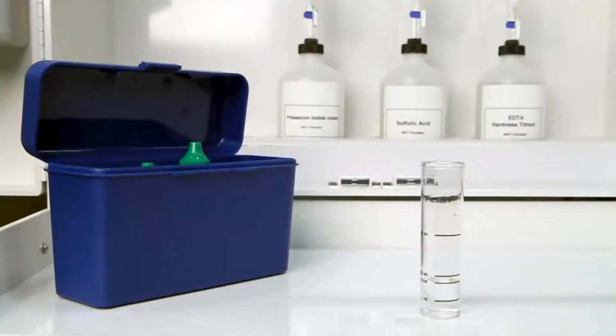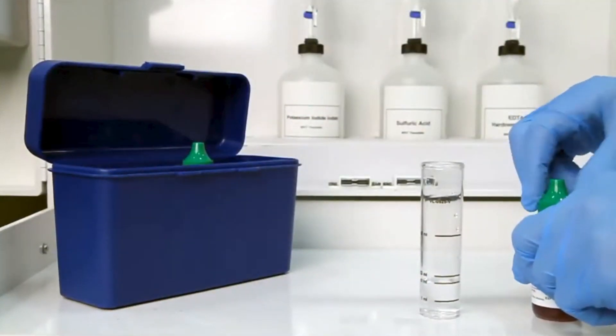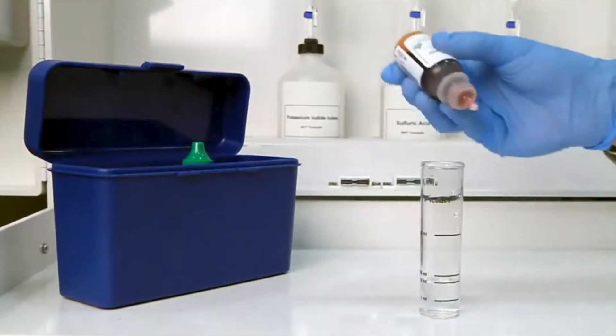The next step according to the EndpointID procedure is to add eight drops of ferro and indicator. The bottle contains a dropper tip, so it's important to hold the bottle vertically to get a consistent drop size.